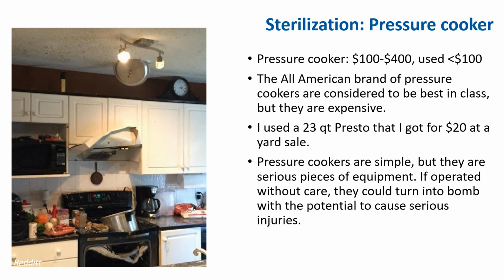Although pressure cookers are simple, they are still a serious piece of equipment. If you operate without care, they could turn into a bomb with potential to cause serious injuries. You can see this picture here of someone who forgot about their pressure cooker and the pressure got too high, and if there's not a proper vent, it will explode.